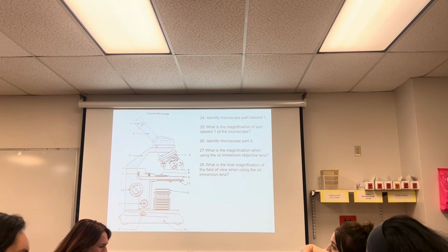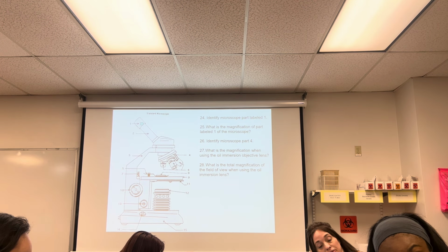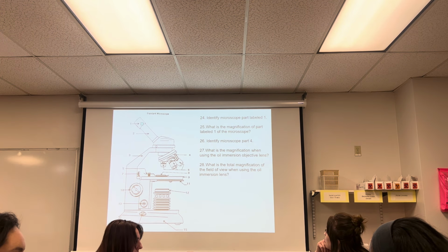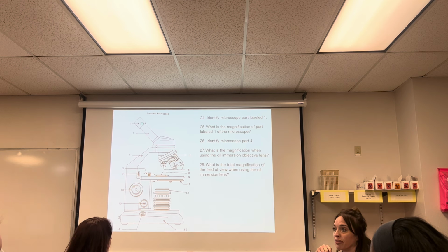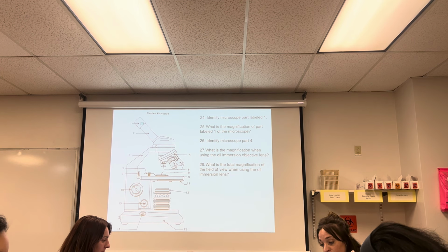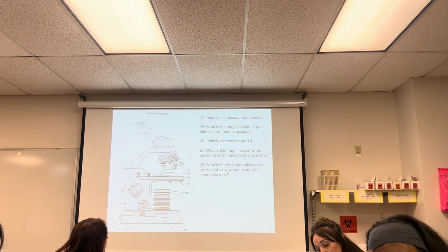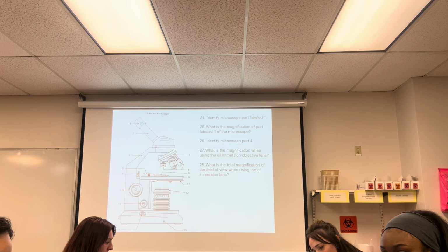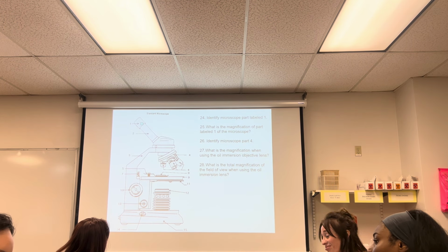Okay, here we go. I have a question. Clarify, were you pointing at 9 or 11? 9. Because you were like, you need to know the diaphragm. Number 11. Number 9 is the stage. Yeah, I was going to say the stage. But I thought you had number 11 as the diaphragm. That's why I was like, wait, did I get that wrong? We haven't had the test yet. Well, no, but like if I did. Y'all are too stressed out for me. Y'all need to take a chill pill.